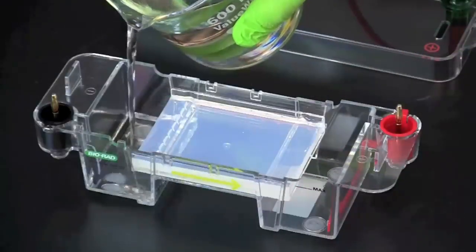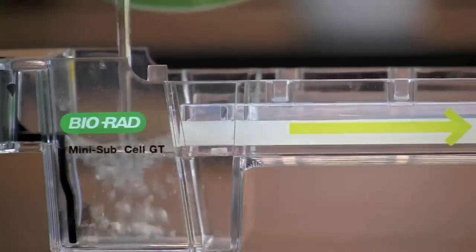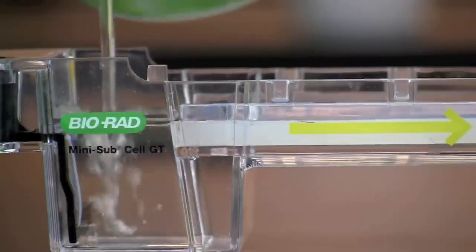Add electrophoresis running buffer to the reservoirs at each end of the gel chamber, and keep adding buffer until the wells in the gel are covered by at least 2 millimeters of buffer.